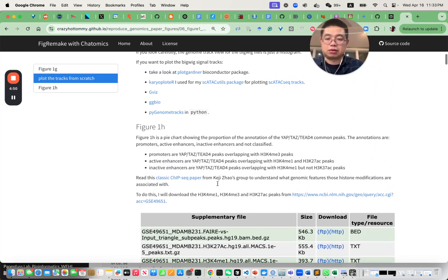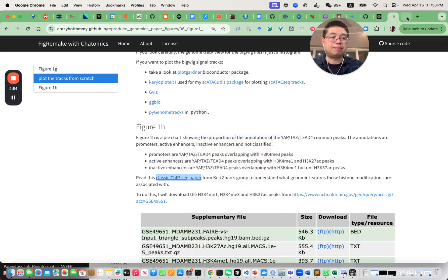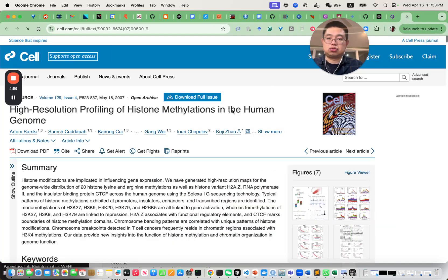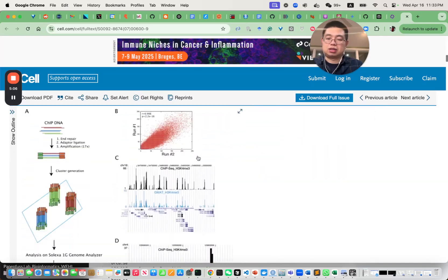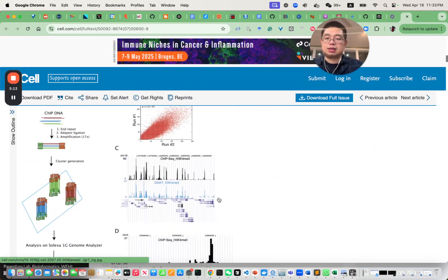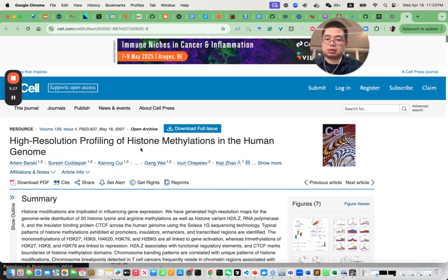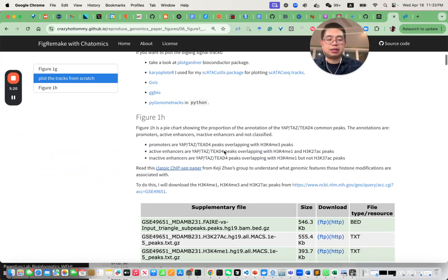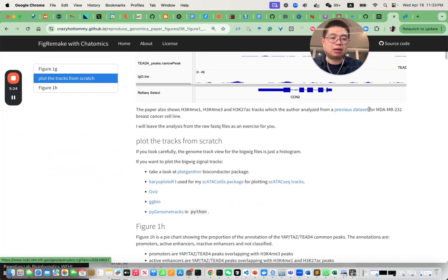They provide histone modifications — I think it's a Cell paper. They profiled a lot of histone modifications in the human genome and defined that H3K4 monomethylation is an enhancer mark and H3K4 trimethylation is a promoter mark. This was probably back in 2007 or 2008. What we need to do is download that dataset.